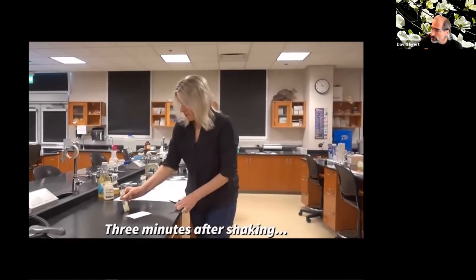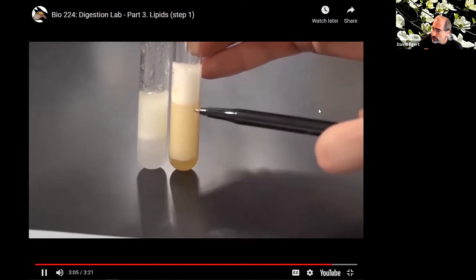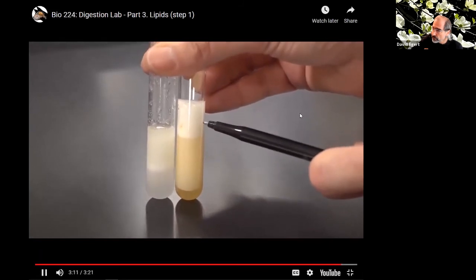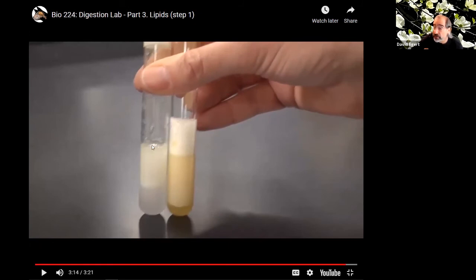All right, so after 3 minutes, we can see that we have water and oil separating in test tube A, and in test tube B, we see an emulsification layer here in the middle, and then water down at the bottom, and then we have some foam up here at the top. Right, so you can see a pretty dramatic difference. Oil and water are separating into oil on the top, water on the bottom again. In this tube, the lion's share of it is this mix of tiny little droplets that are just suspended individually and still floating within the aqueous solution. That's what we call emulsification, right?